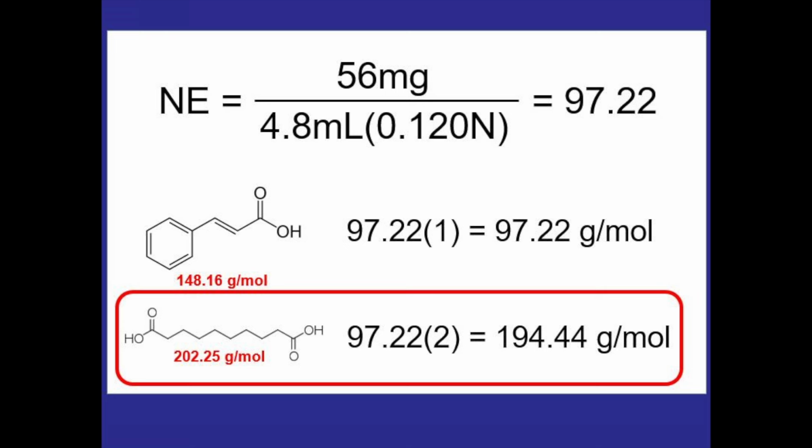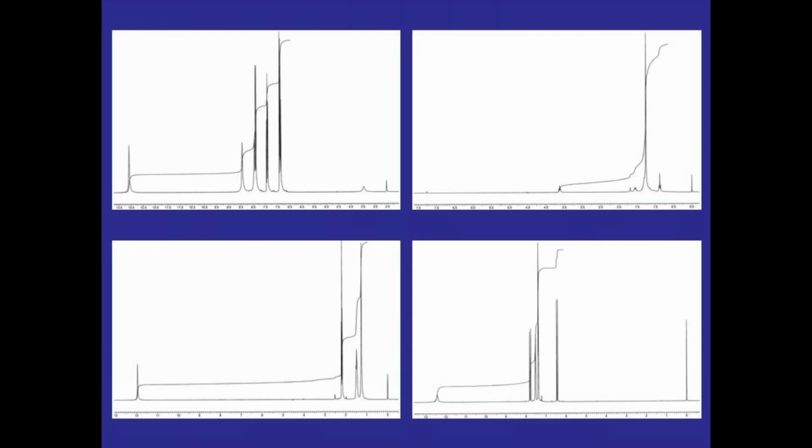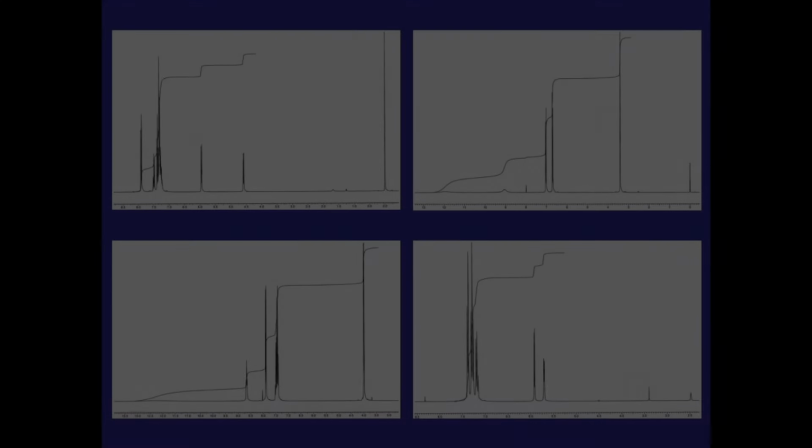And then the second part is to look at the bottom of the procedure through all of the NMRs and find the ones that we think match up with the 2 compounds that we had. Then we'll draw the molecules and label the peaks just like we've done in all of the other labs. When labeling these, be aware that the NMRs were done with dry solvents, which allow coupling between alcohol groups and neighboring hydrogens, which we haven't really seen before. So we'll actually see splitting for the alcohol peaks, and they'll also cause splitting for neighboring hydrogens as well.